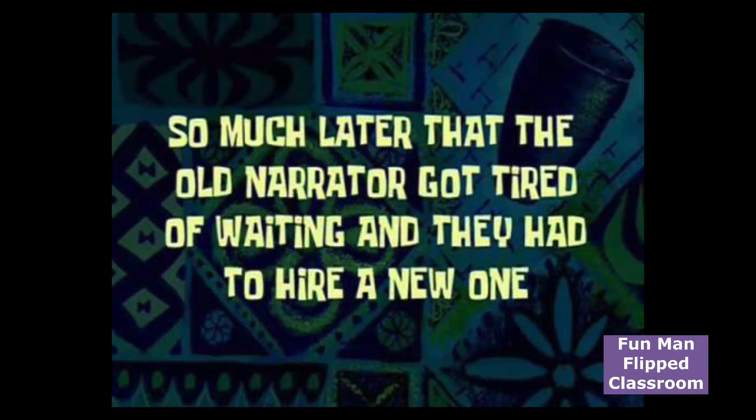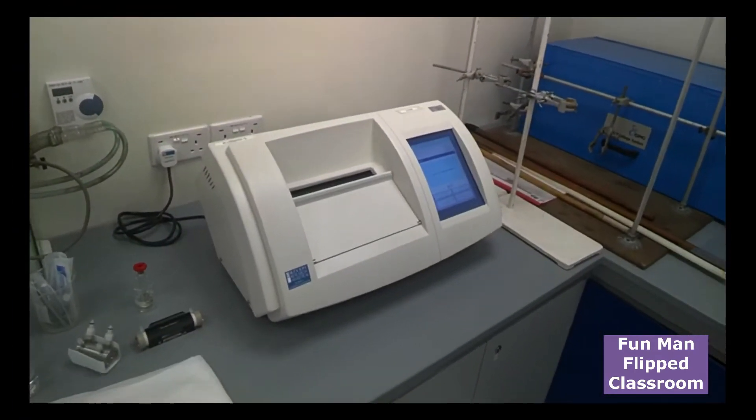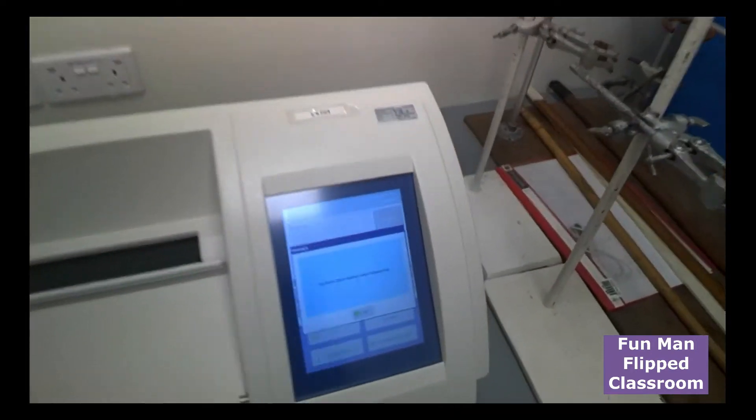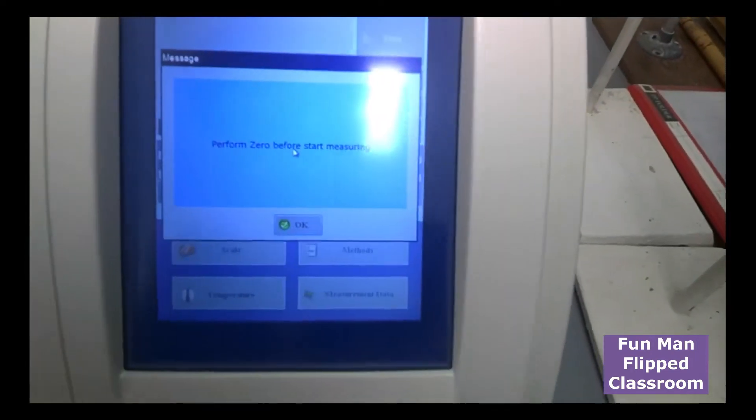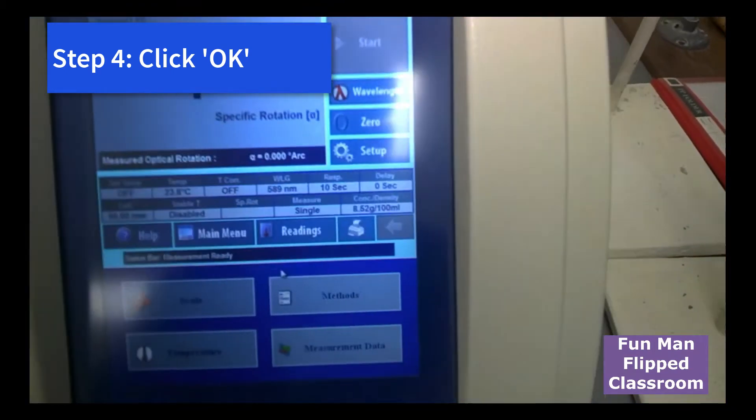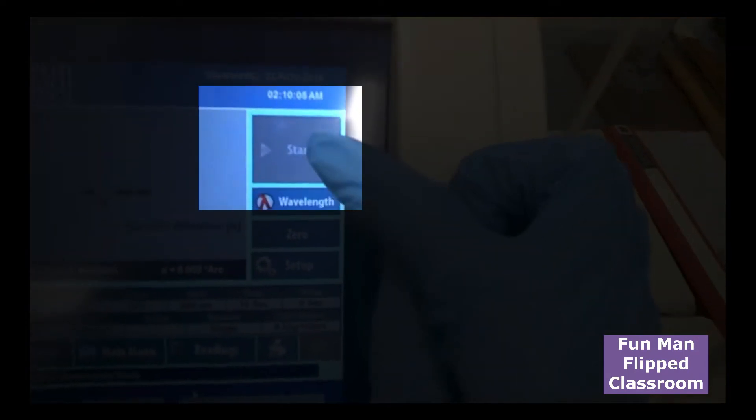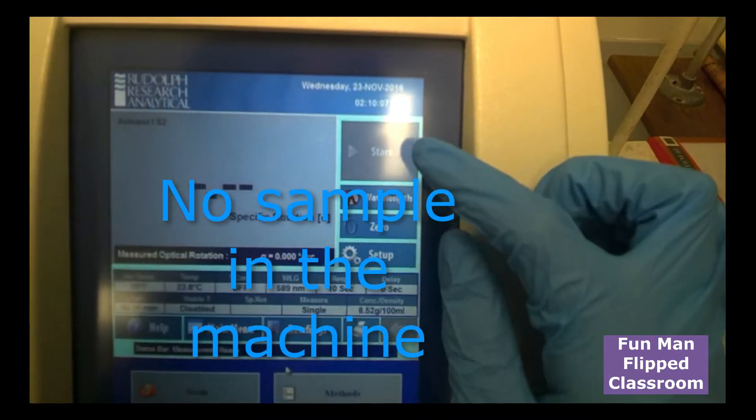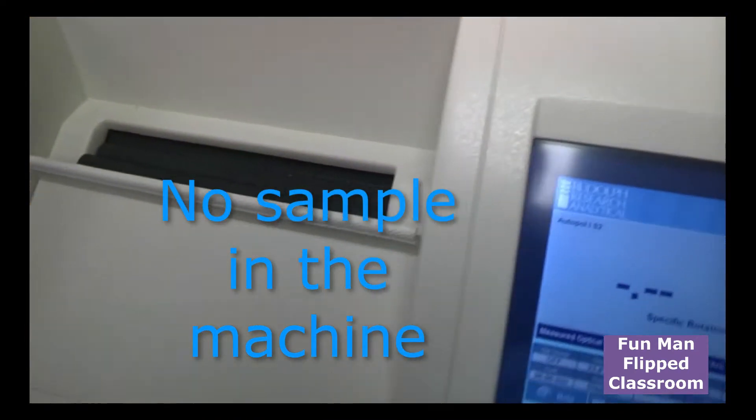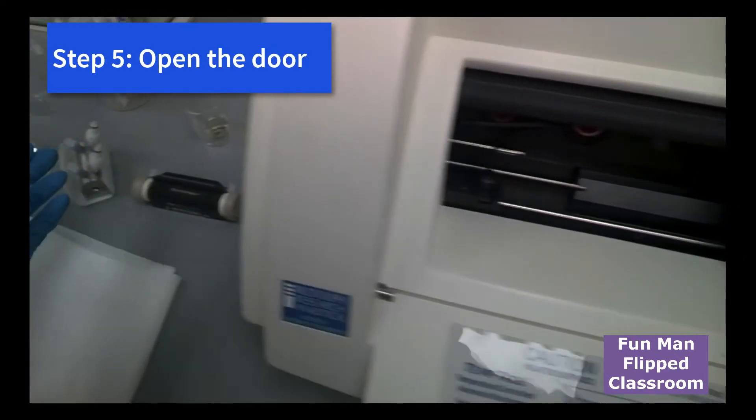So much later that the old narrator got tired of waiting and they had to hire a new one. Okay, so guys, now we are back. The machine has already warmed up. We can start the experiment. So you see on the screen, it says here that you got to perform zero before measurement. So we click OK. And you see the panel here. There's a control. The start button is now in grey. You can't click first because there's no sample inside the machine. Now you need to place the sample later on. Open the door and place the sample inside.